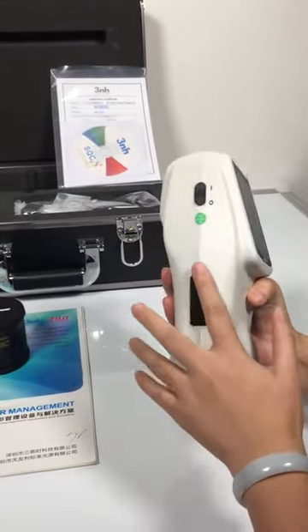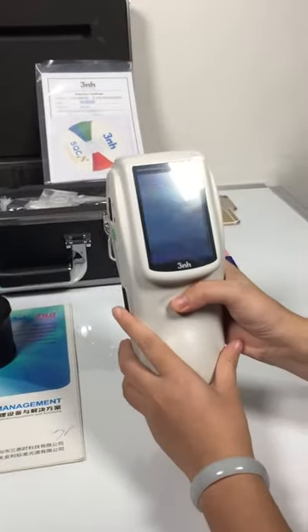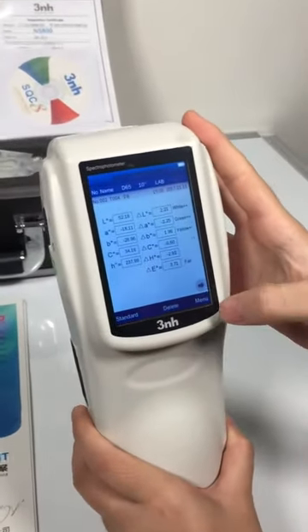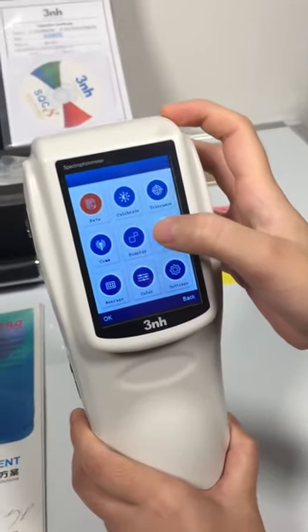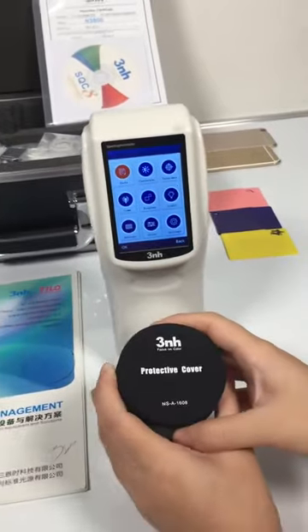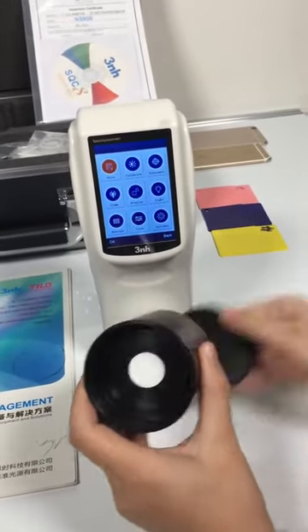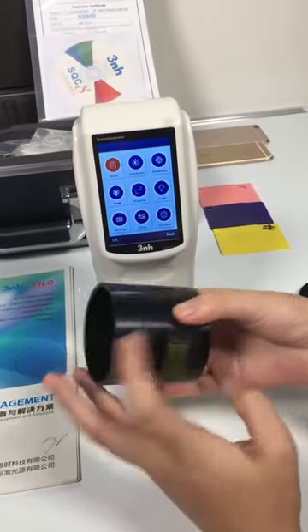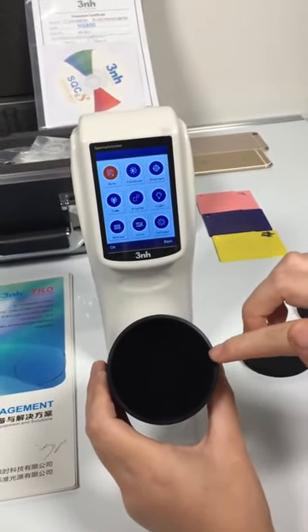First, we turn on the machine. We do the calibration first. This is the calibration board. This is the white calibration board and this is the black calibration board.